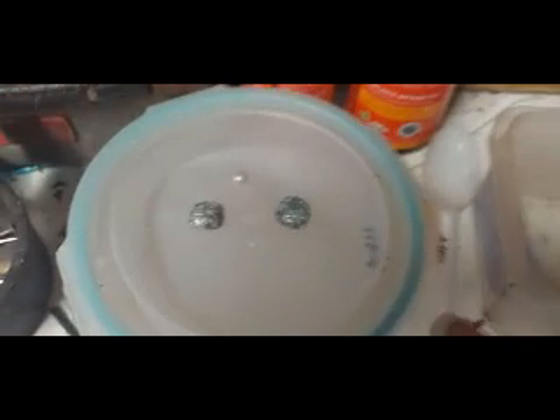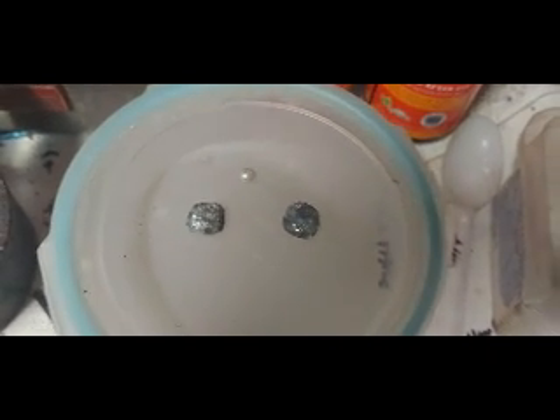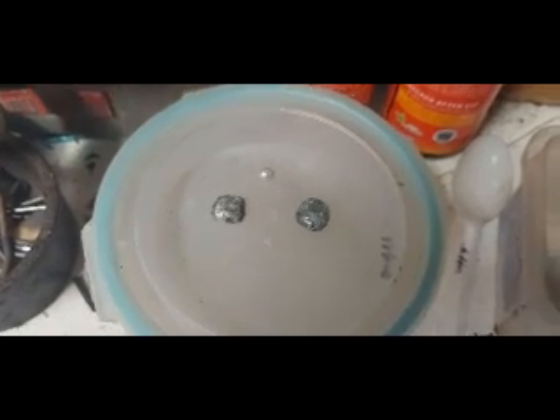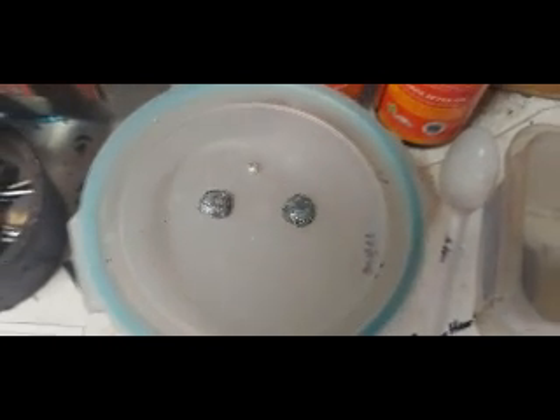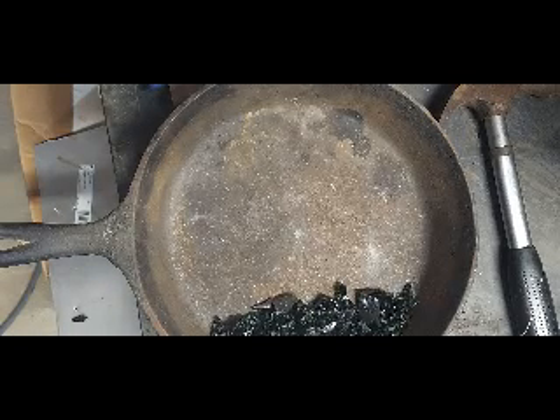Here we go — these are our two lead buttons. This has already been cupelled. Point four five and point four eight grams from about 65 grams of material. We're going to do the grams-per-ton calculation on that after the nitric treatment. Let's get these in the furnace.